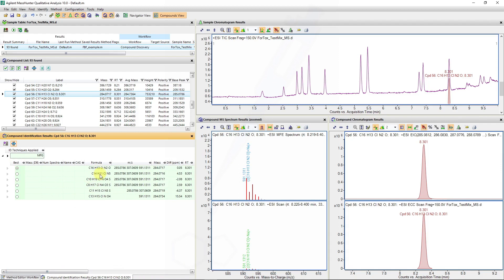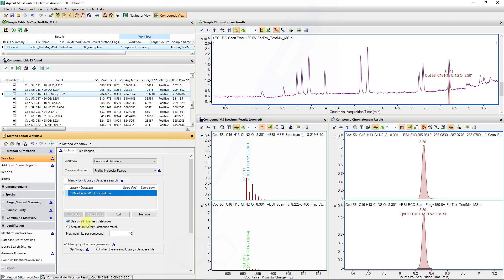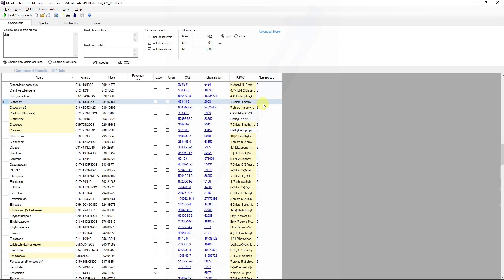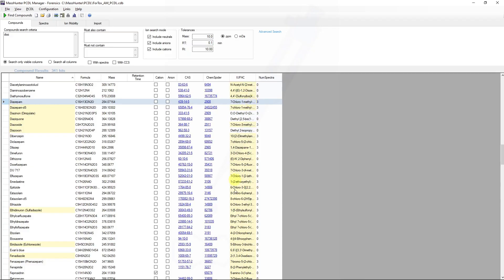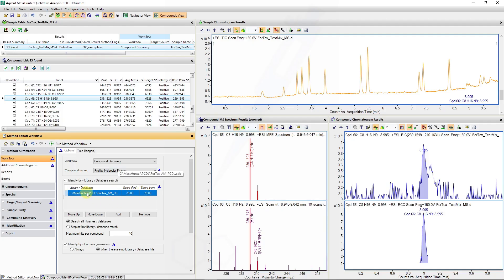The formula C16H13ClN2O corresponds to diazepam. Now we can do an additional identification using a compound library. In the PCDL manager, I can see I've got the diazepam entry with a formula. Some of this information will be used depending on whether you have MSMS data files or not, to improve the formula prediction and matching during the molecular feature extraction. I've specified my database to help with molecular feature identification, screening against our PCDL database.